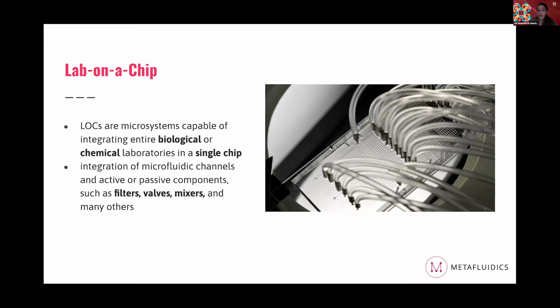They do this by integrating microfluidic channels and using active and passive components like filters, valves, mixers, and many others. You can see a photo of an up-close lab-on-a-chip system. Next slide.